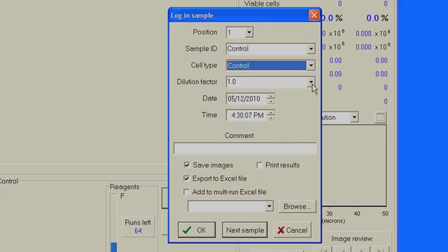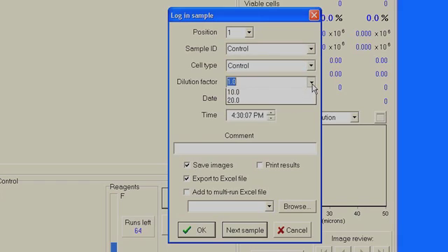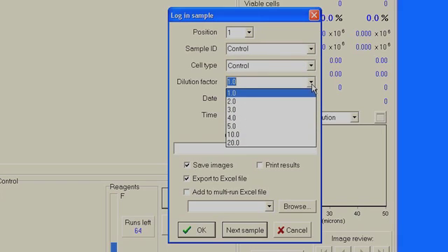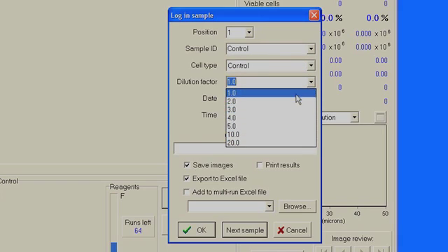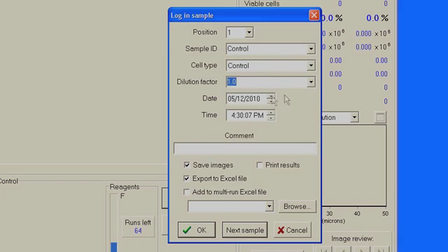Select the dilution factor if the sample is pre-diluted. You also have the option to export your data to an Excel file. Press Start Q to begin the analysis.